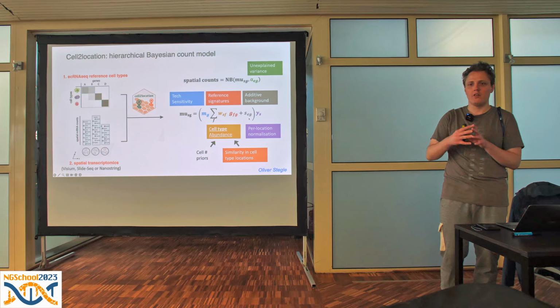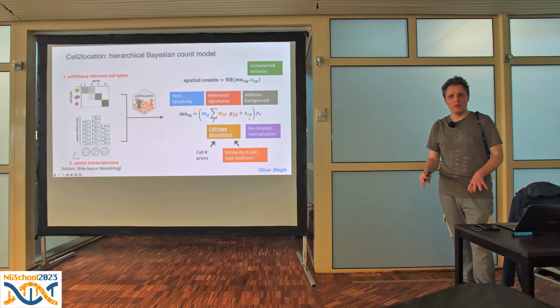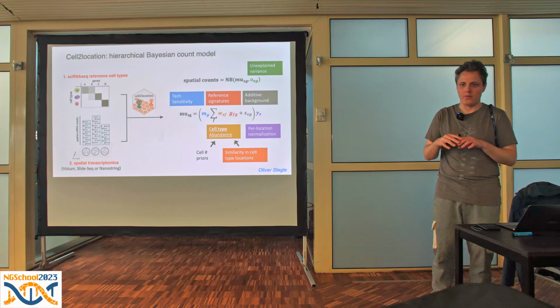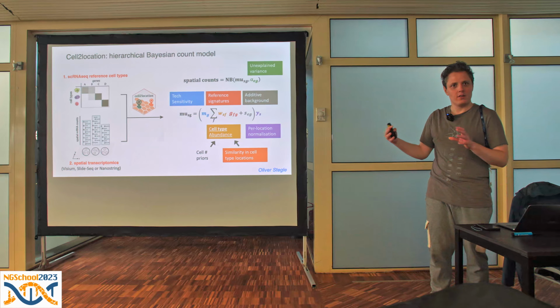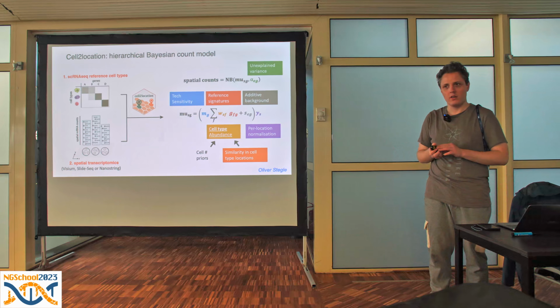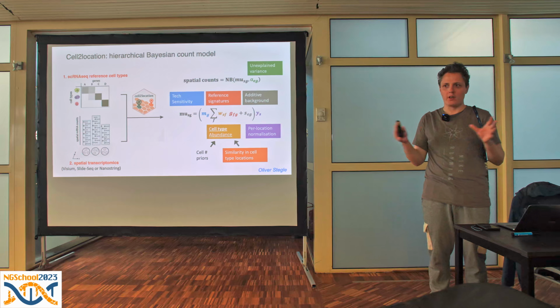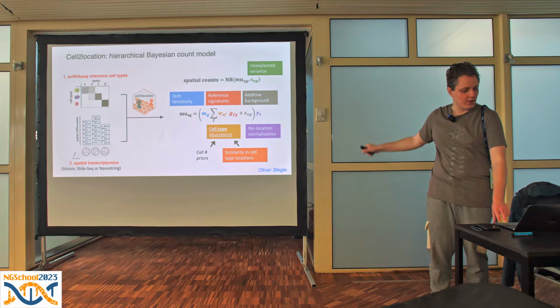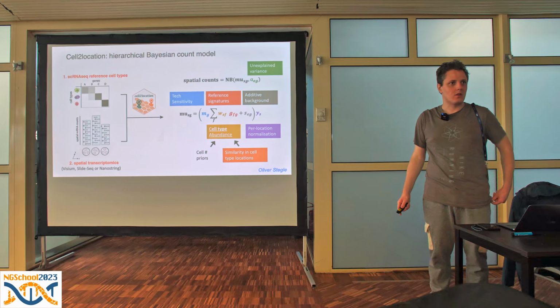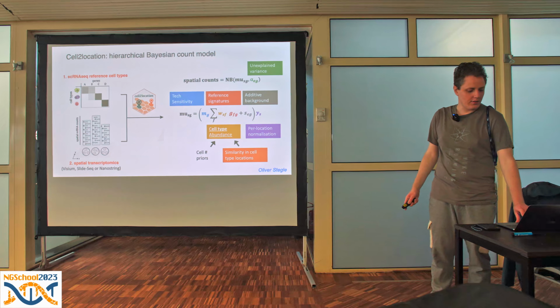And what this normalization deals with is gradients in how well detection works. And in some experiments it is not really necessary, but in practice we see that in most experiments, especially from more challenging tissues rather than perfectly preserved mouse tissues, you actually have to do quite a lot of normalization. And yeah, so hopefully that makes sense. Any questions about the model?